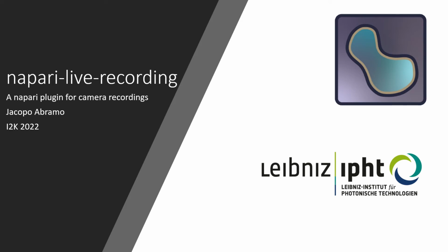I'm a PhD student at the Leibniz Institute for Photonic Technology in Vienna, and today I will present napari-live-recording, which is a Napari plugin which I use for camera recordings.